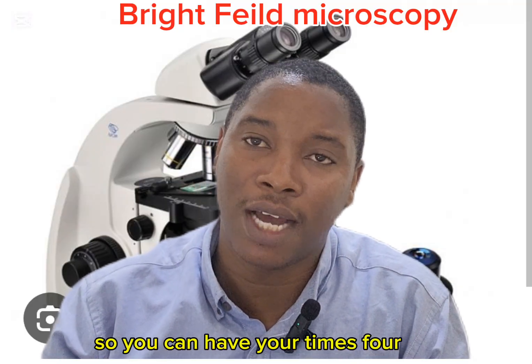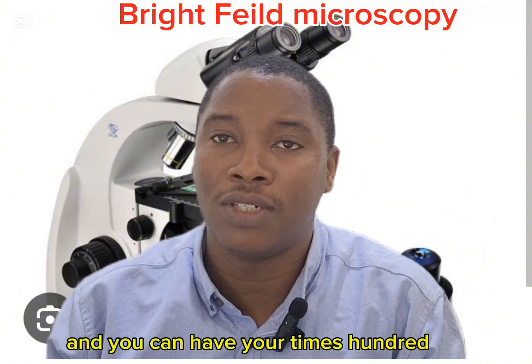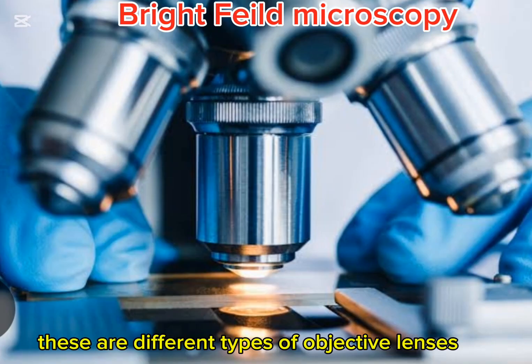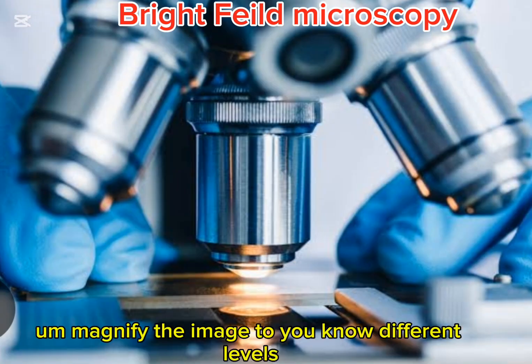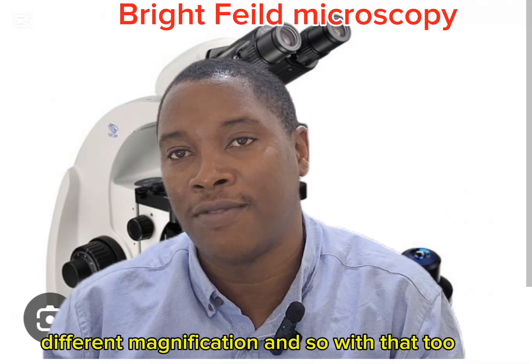You can have your times 4, your times 10, your times 100, your oil immersion. These different objective lenses will magnify the image to different levels, with different capacities.